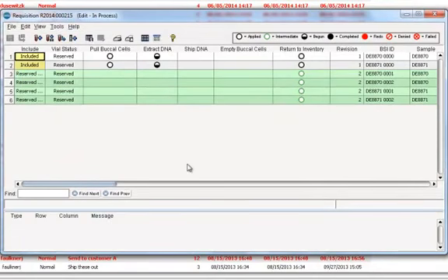Notice that the tasks are applied to the specified specimens and the child DNA vials are already created. For this example, I'm going to quickly complete each task to show the template behavior.